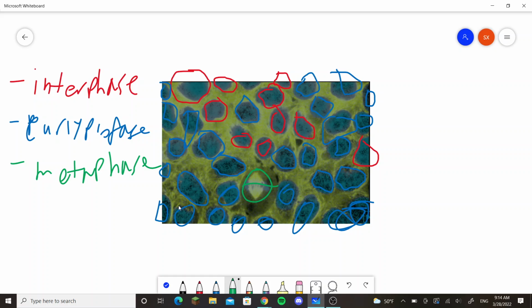It's not an anaphase, and people often confuse metaphase with anaphase because there are spindle fibers stretching out, a bit like in this formation, right? However, if you can draw a straight line through every single chromosome, then you know it is in metaphase, because they line up at the equator of the cell. So that's metaphase.